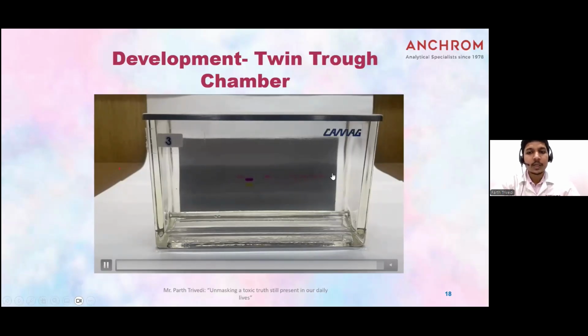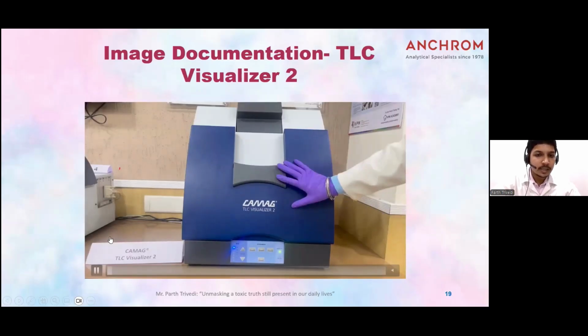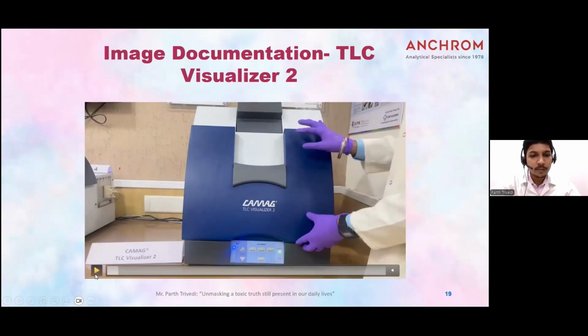And yes, the run has been completed, and after removing the TLC plate we will dry it and do the further analysis, as you can see. So this is a CAMAG TLC visualizer. It looks like this, and first of all we will see how the visualizer looks from the inside.